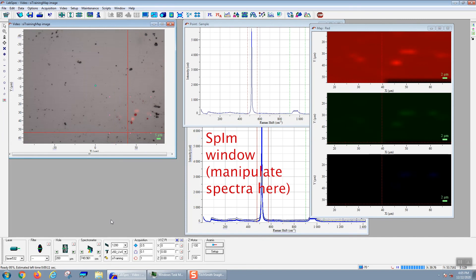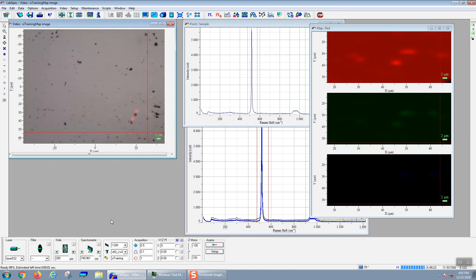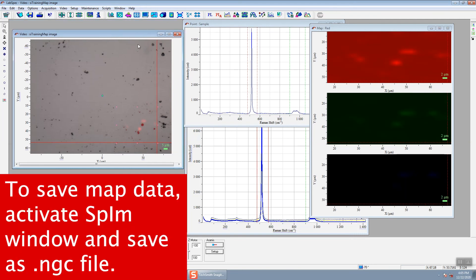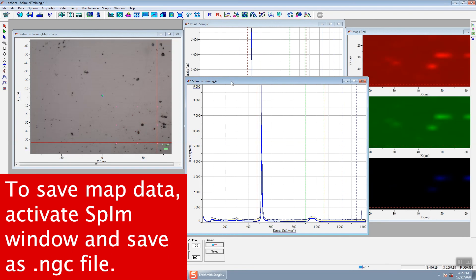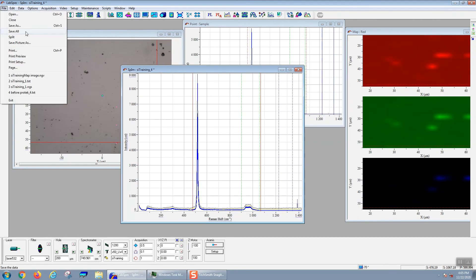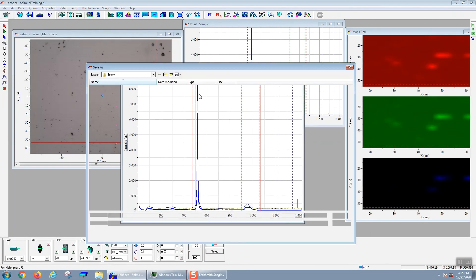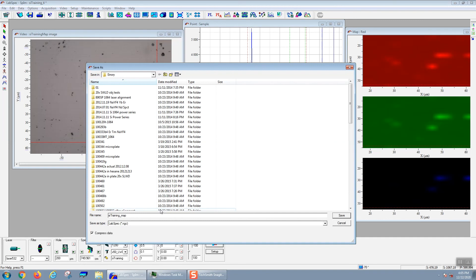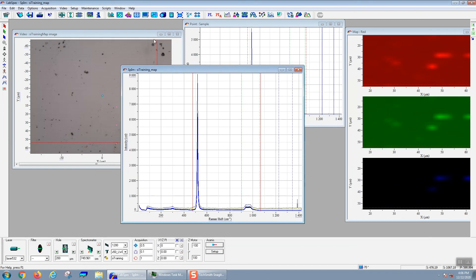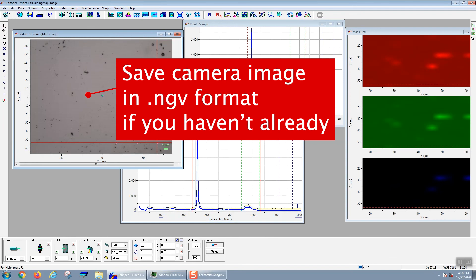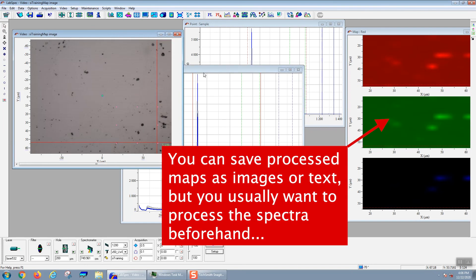The first thing you want to do when you finish an acquisition of a map is to save that SPIM window. You'll bring that window to the front by clicking on it and then go to File, Save As. You're going to save it in the labspec.ngc format. Here we're going to save this file as sitraining_map.ngc. We also do need to save the video image, the video camera image, but we've done that already. You can save the maps, but generally you're not going to do that until you've done all your processing.